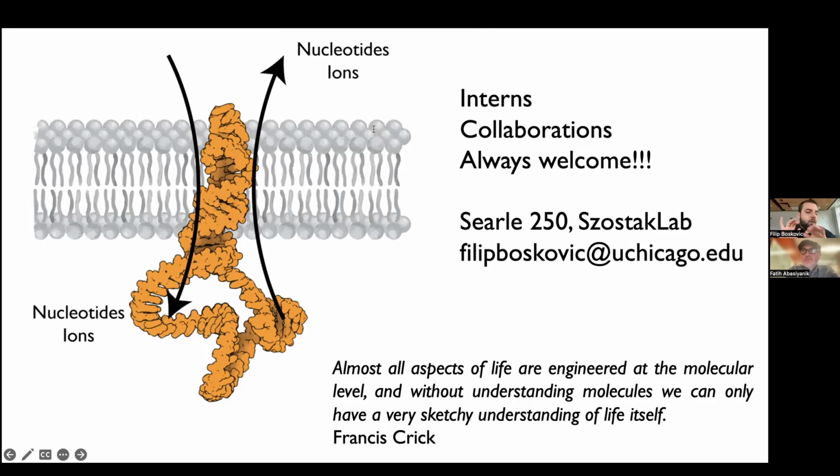If you just go to their website and write single cell, there is actually a workflow. You don't use any special kit. I think usually the 10x should be enough, but don't hold me fully. I haven't checked that. I think you just follow the 10x protocol, and after that you just do ligation of the adapter, and then you just do sequencing. So it should be very straightforward. You behave as with any other sample.